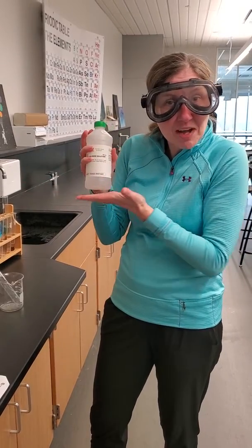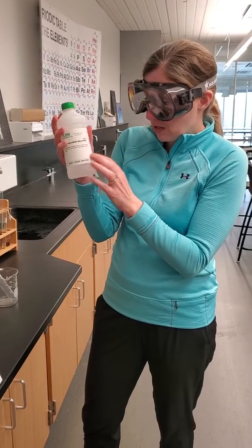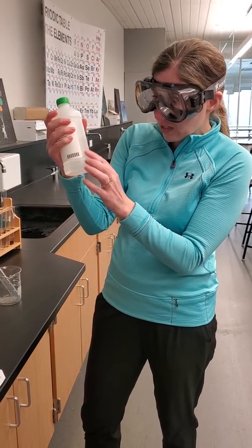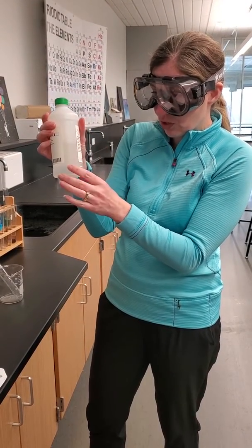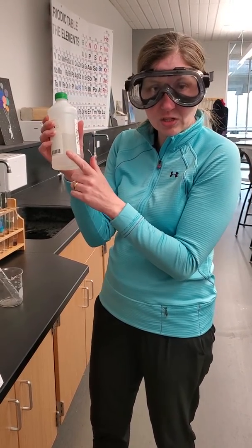All right, reaction number 5 is going to start with the zinc chloride solution. Zinc chloride means that there are zinc ions and chloride ions floating around in this solution. It's clear, so neither of those ions provide a color to the solution.